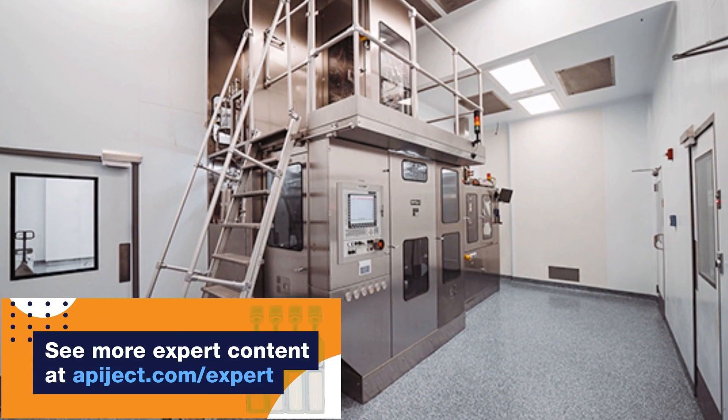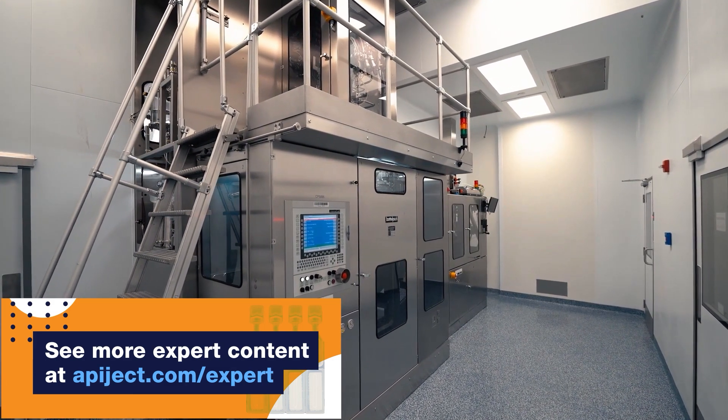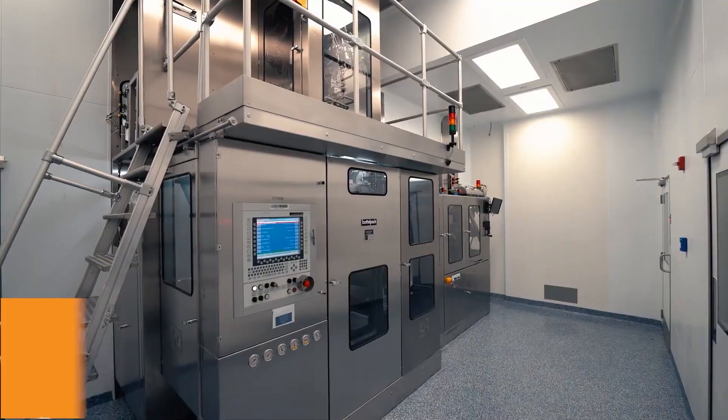Here's a look at how the BFS process works on a rotary BFS machine, specifically a Bottle Pack 460 made by Romaloc.